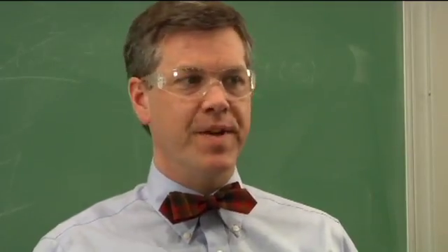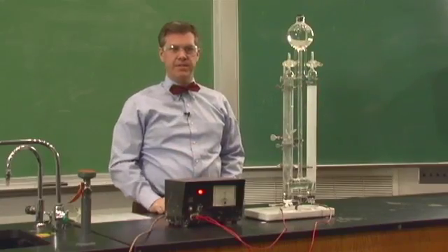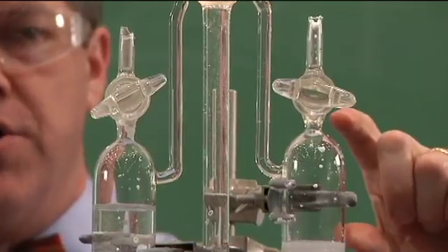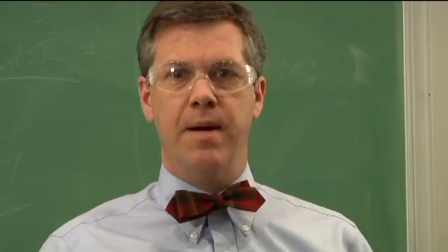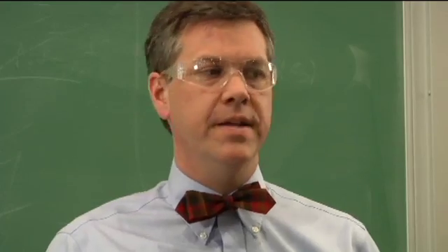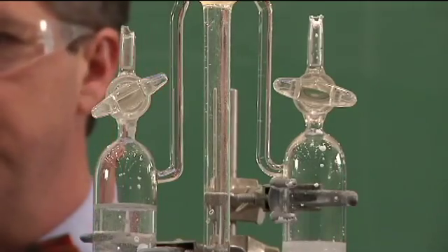After about five minutes, we collect up an amount of hydrogen and oxygen gas. Note the difference in volume between this bubble and this bubble. No matter how many times we run the experiment, what we find is always two volumes of hydrogen gas to one volume oxygen gas.